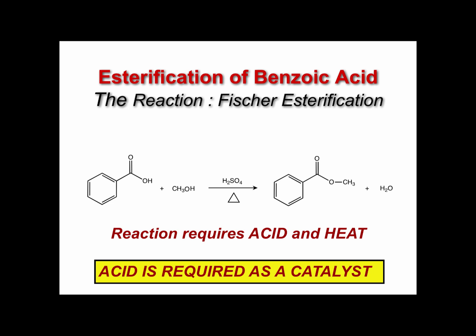Adding HCl, well, you can add it as a liquid, but that's an aqueous solution of HCl gas. HCl in its normal, pure form is a gas. So when you have a concentrated solution of HCl, it's dissolved in water. And if you look at this reaction, what are the products? Your ester, but also water is a product.